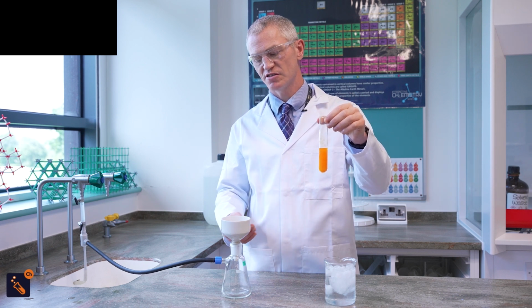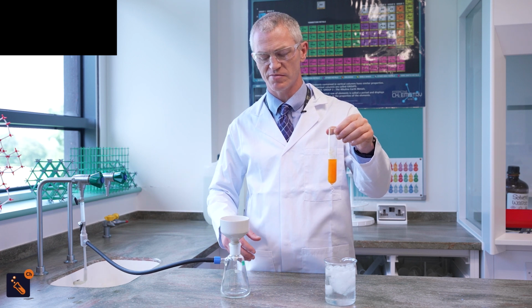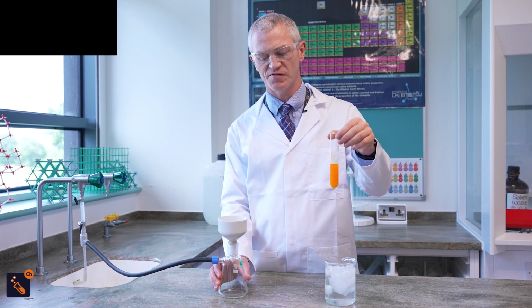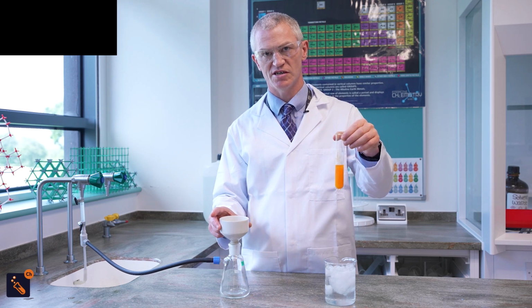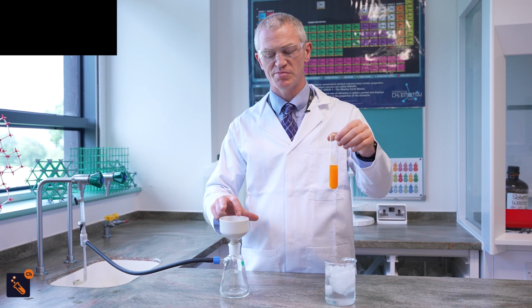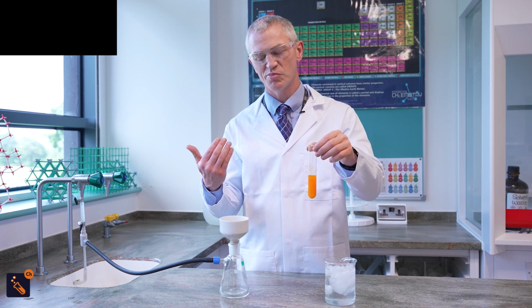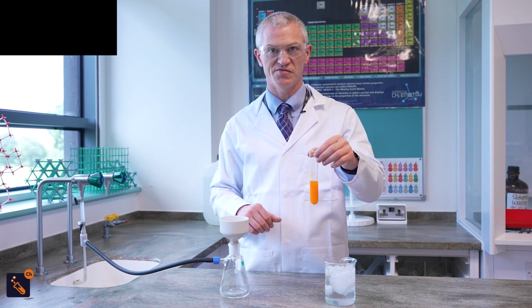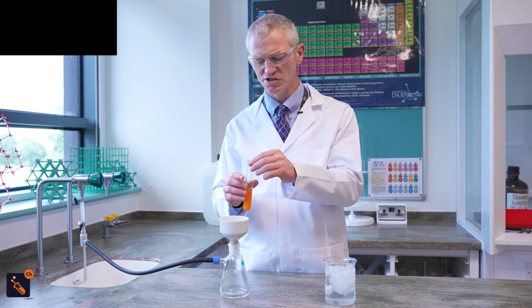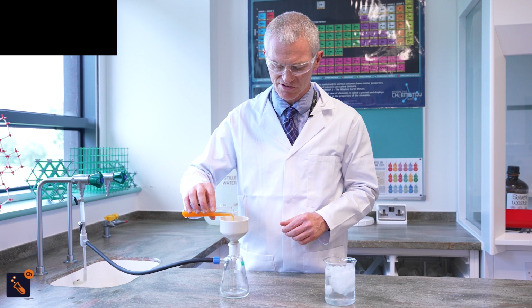Filtration is done via a vacuum trap which is attached to a water tap. We have a Buchner flask, which is the bottom here, and a Buchner funnel, which is here. Then I have a filter paper on top, and what students mostly get wrong when they're doing this is they pour it in too quickly and then the solids go around the edge of the paper.